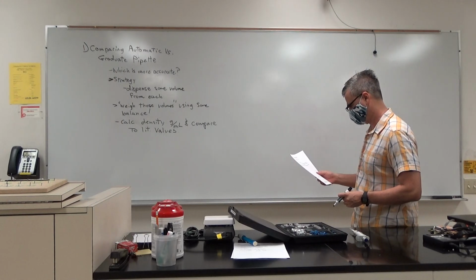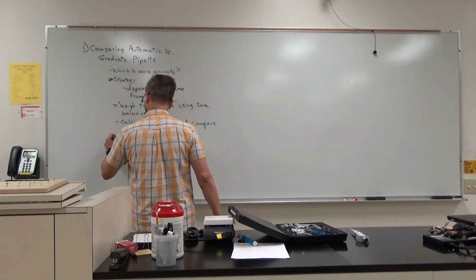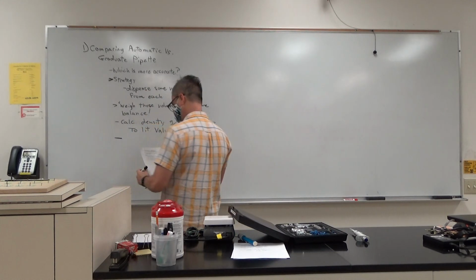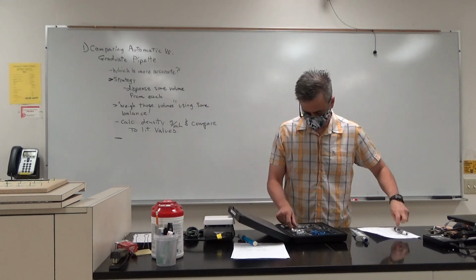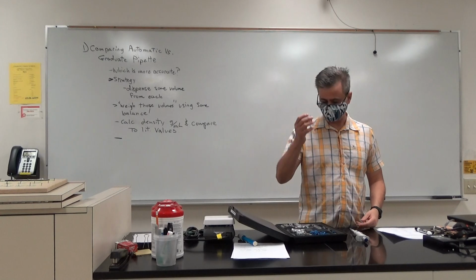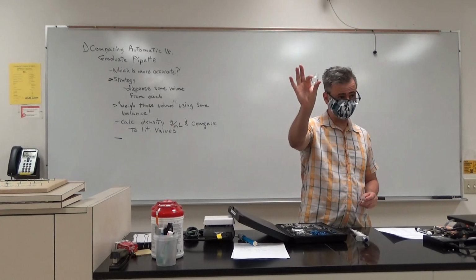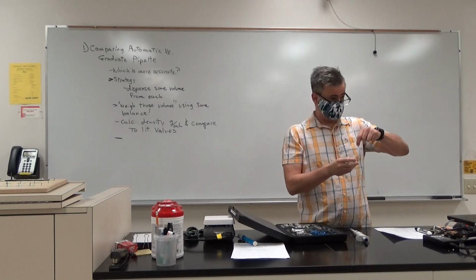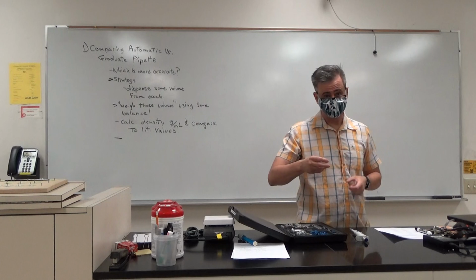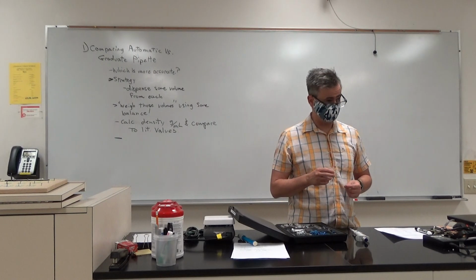Okay, so one thing that I want to emphasize right away is that all semester long, you're going to have either a conical vial or sometimes what's called a round bottom flask, and you're going to have chemicals in it. Then you're going to be moving around the lab. Whenever you do that, you want what we call a secondary container.